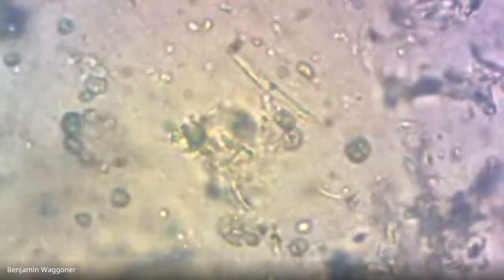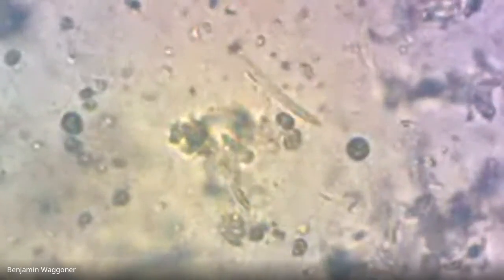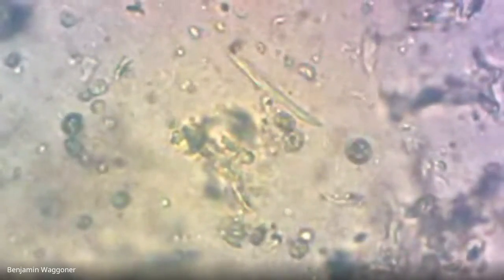If we look over, okay, there's another couple of little flagellates right there. It can be hard to tell the difference between purposeful movement and just Brownian motion. The random trajectories that little particles in water have just because they're being hit at random by randomly moving water molecules.